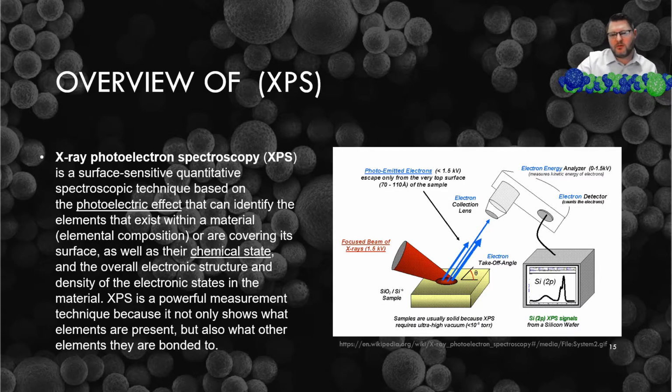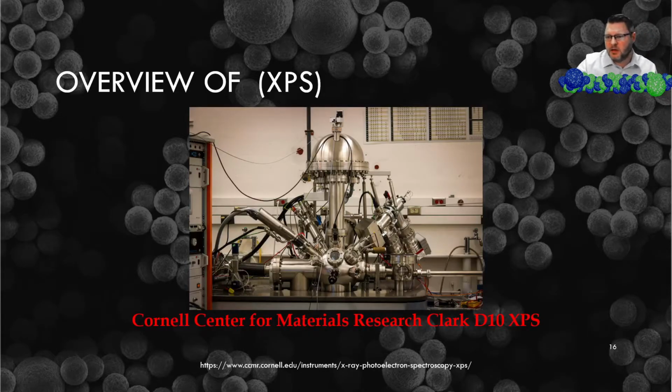Like I said, we're going to go over that just really quick, and this right here is it. So this is Cornell's XPS. Pretty interesting looking.